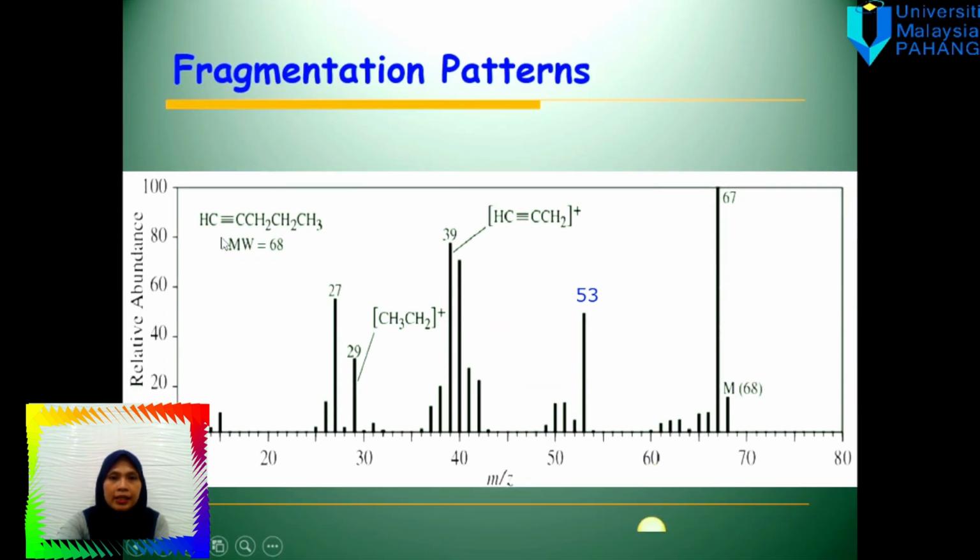So we can see here, this CH2 and the second CH2 only will break. It cannot break here. It will break here, and then it will not break here.